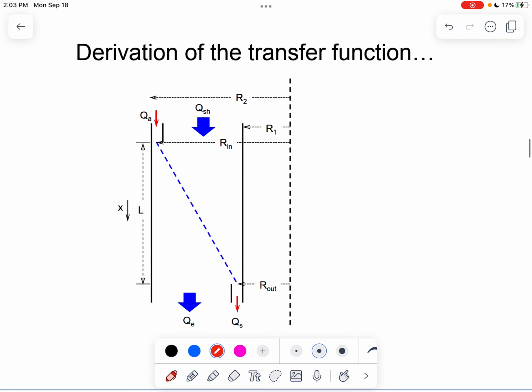So if we also start from this perfect trajectory here, then we'll see that for the particles that travel from the outer wall of the inlet, right, they'll follow a similar trajectory and get collected by the inner wall of the outlet. So the same thing for here, which is on the other boundary, right?